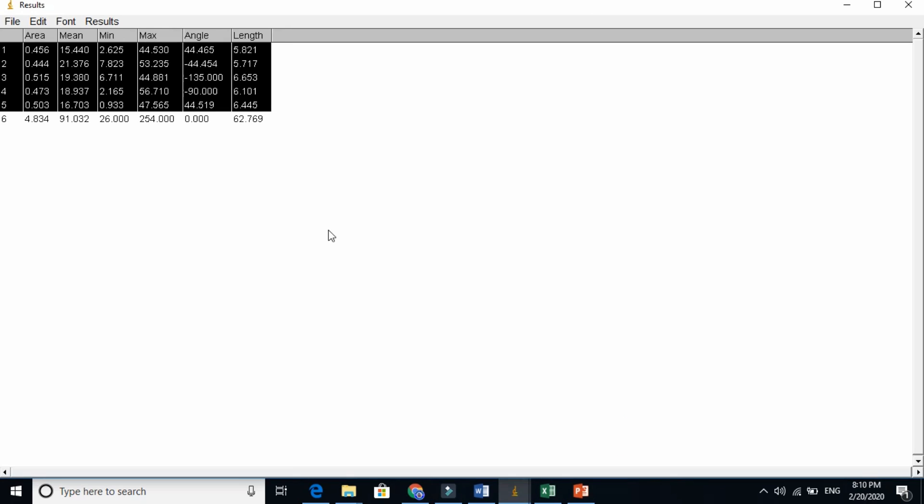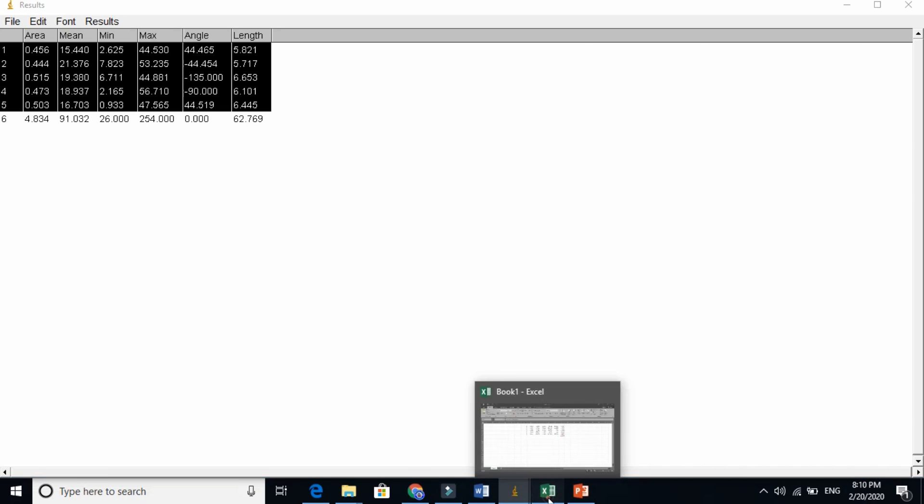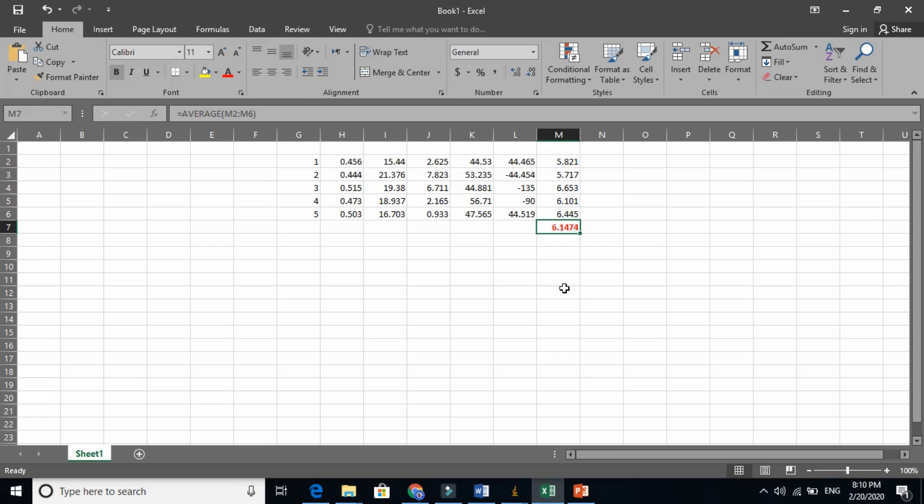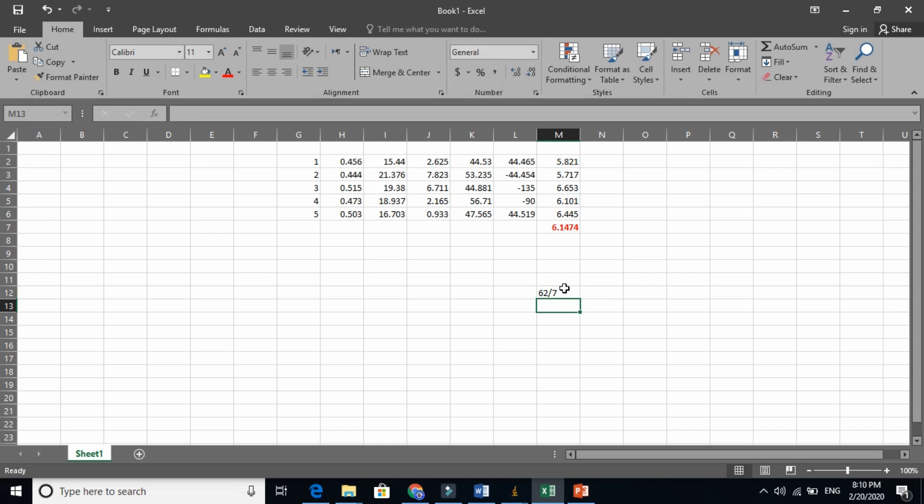Now it is 62 here. So 62 divided by seven. Just do by calculator, 62 divided by seven.